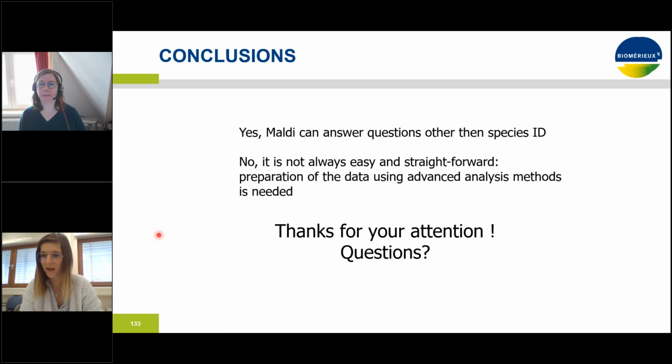Great presentation. I often work with BioNumerics for subtyping. Is there an online training module for the LDA and machine learning? Yes, we do have a tutorial for that. So you can contact me and I can send it to you.